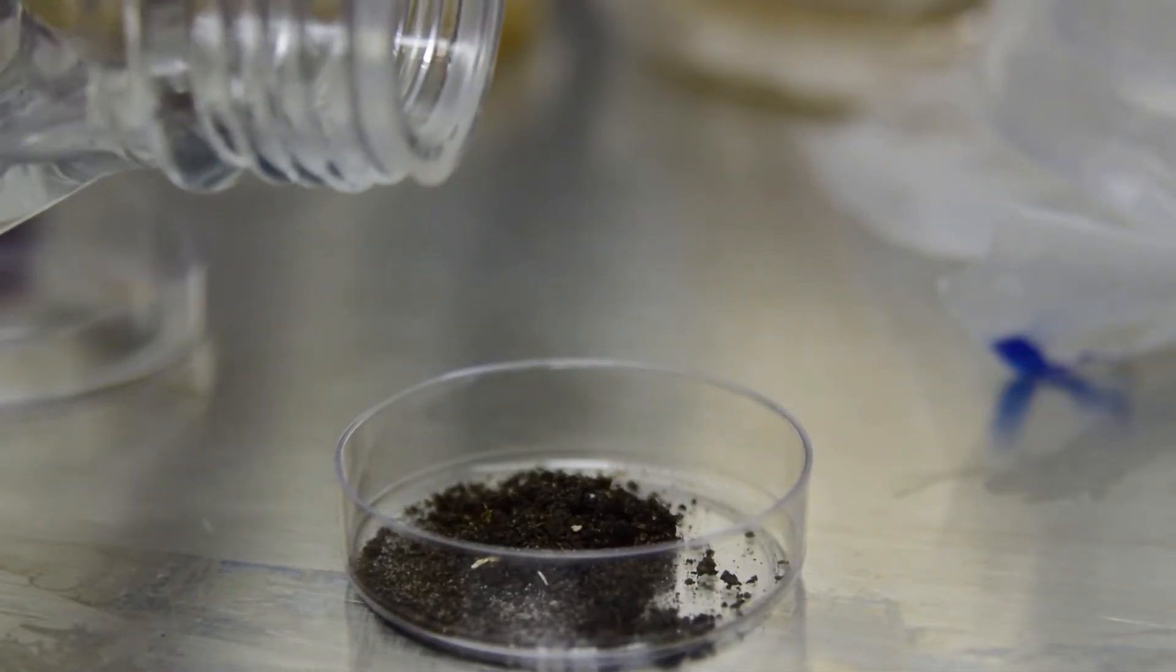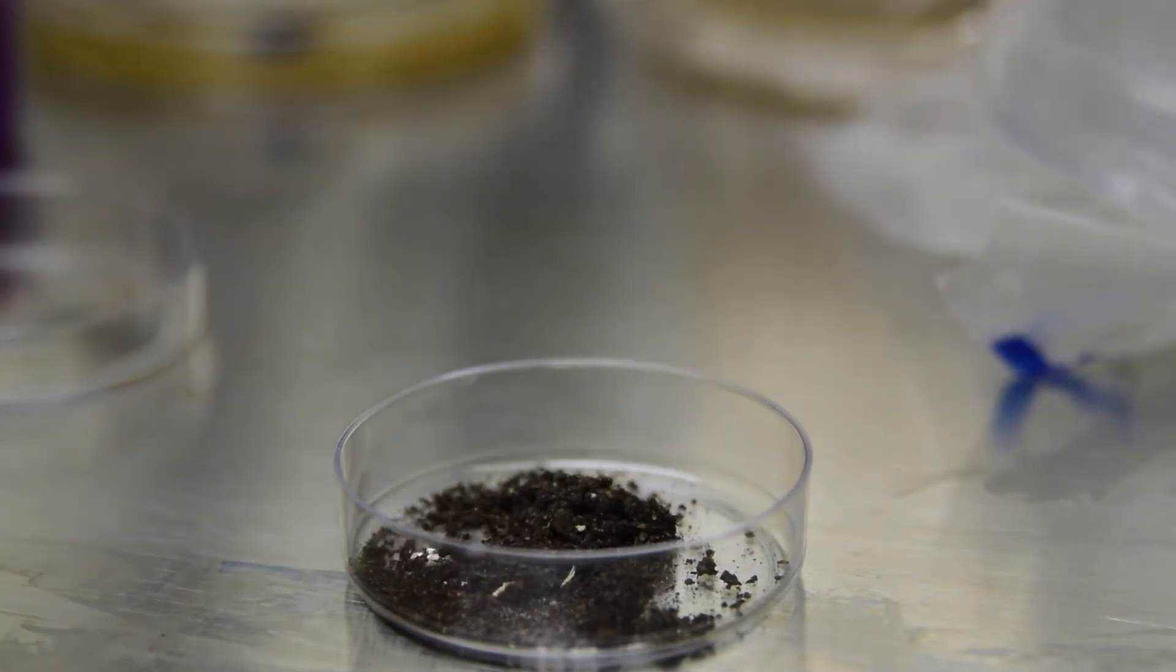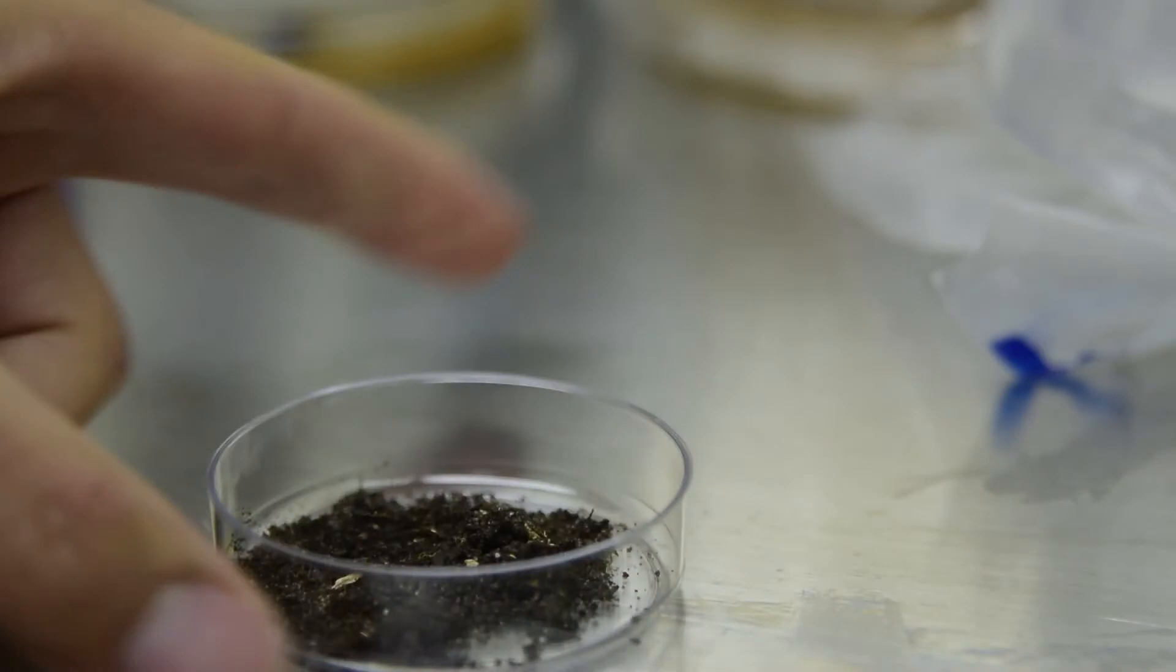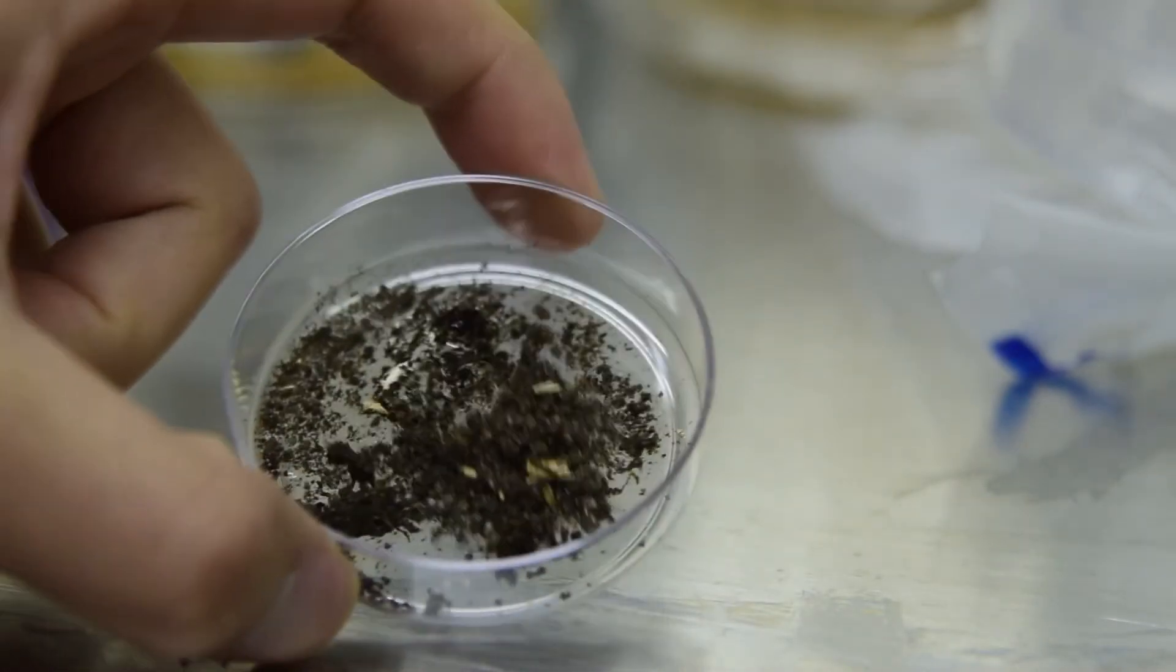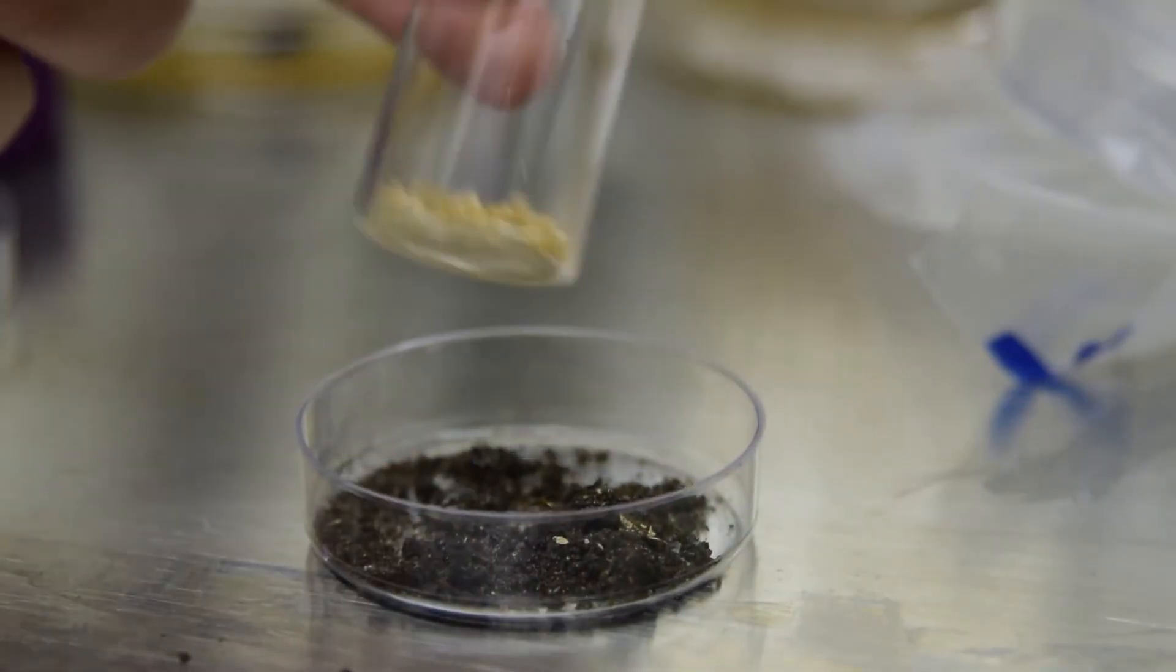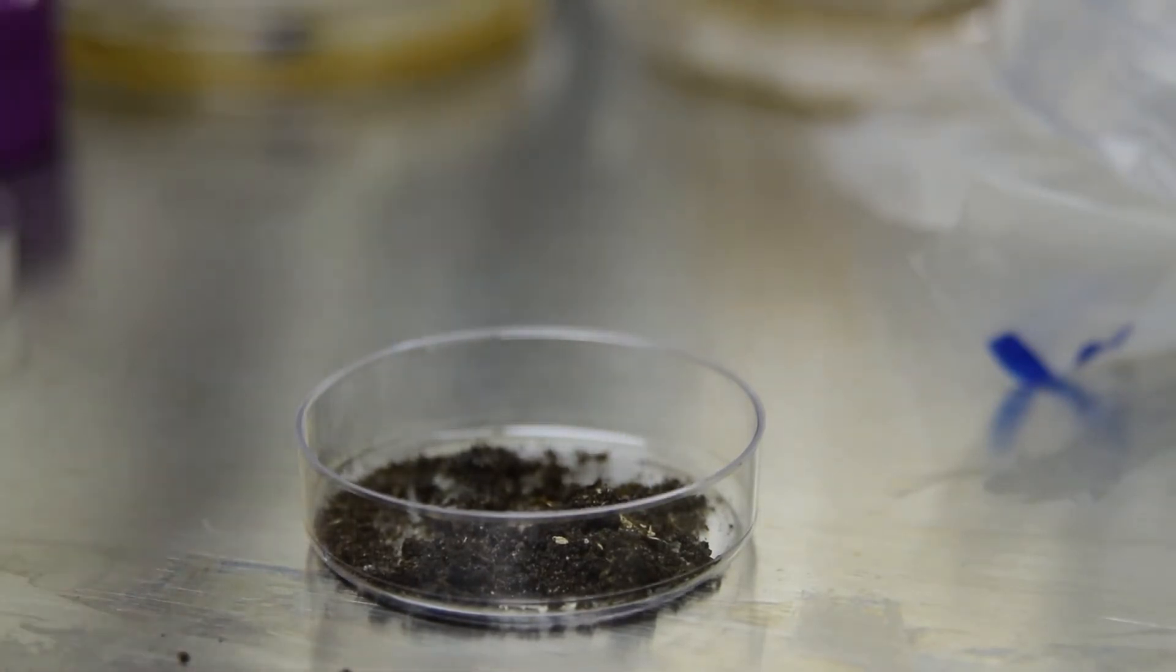Add sterile water to the soil, just enough to moisten. Add sterilized crab or shrimp shell pieces, one or two per plate.